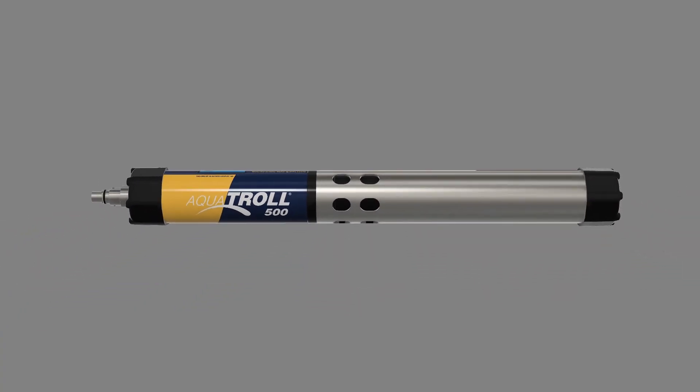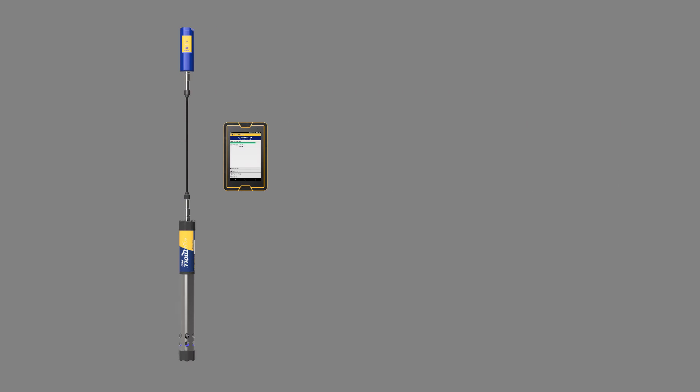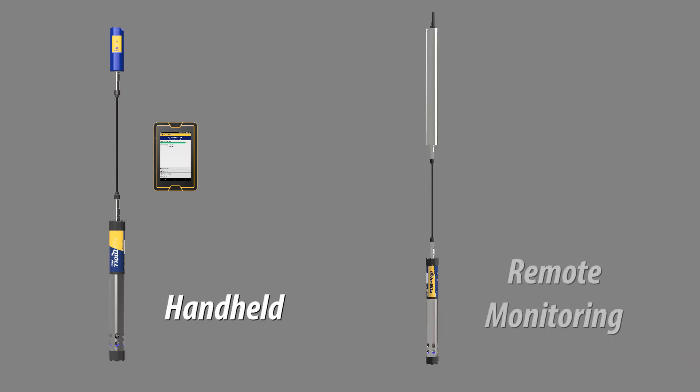Introducing the Aquatrol 500, a mobile, user-friendly water quality instrument with the accuracy and reliability you've come to expect from In Situ. The Aquatrol 500 is ideal for handheld testing, as well as remote monitoring with telemetry or external data logger.